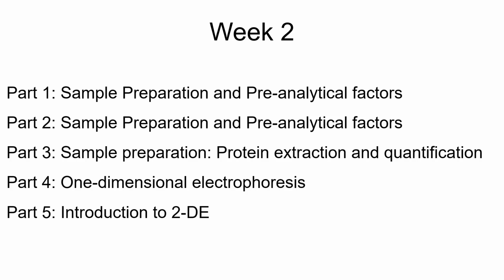What types of precautions you need to take, what types of contaminants you need to remove, how we can remove them, how essential it is to have a purified protein when you are doing the analysis. All of that will be handled in week 2 lectures. So we'll be dealing with sample preparation and a few pre-analytical factors, as well as extraction of proteins, and after extraction, how we can quantify them. And we'll be dealing with two specific techniques basically, one-dimensional electrophoresis and two-dimensional electrophoresis.